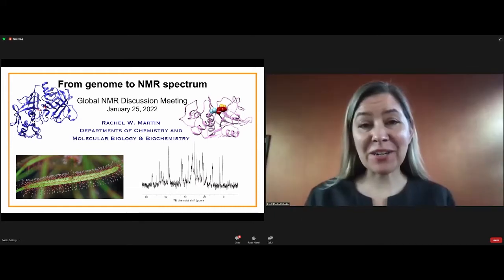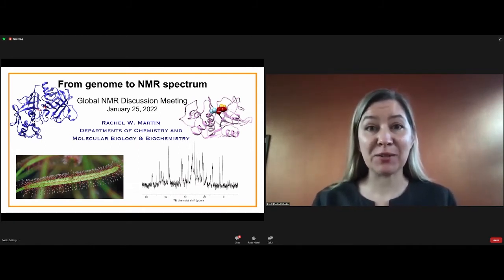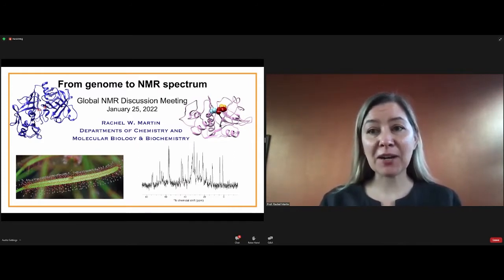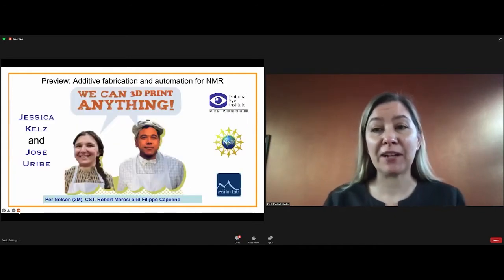All right, thank you very much, Moja and the rest of the committee. I'm really happy to be invited, and I wish that we could do this in person, but it's great to be here and talk with people in the NMR community. So today I'm going to talk about a different aspect of NMR spectroscopy. A lot of you have probably seen me talking about building probes, and today we're going to talk about the other end of the process, which is sample preparation. So I'm going to go through how do we pick an interesting protein target for structural biology.